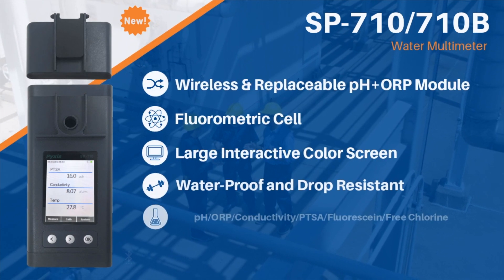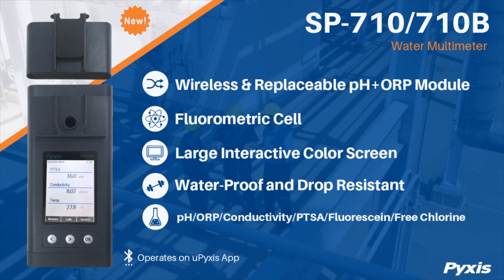Pixis Lab is pleased to announce the release of our newly designed SP-710 and 710B multimeters. This new state-of-the-art design eliminates the need for using three separate meters by offering the industry's only multimeter, fluorometer, and colorimeter in one easy-to-use tool.